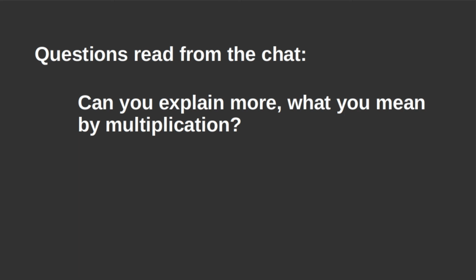In the multiplication, you also multiply with itself, so you push the amplitude closer to 1. But this is more sensitive, as I said, to imprecisions in estimation. So closer to the zero points, this can get a bit more messy. But mathematically speaking, this is just a multiplication of the Fourier spectra.